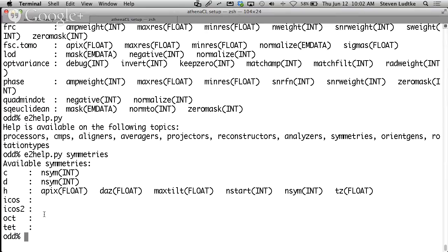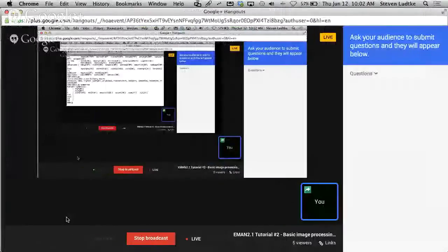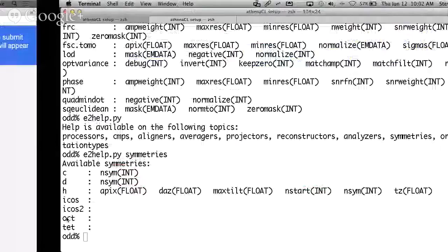You'll notice there are, of course, other symmetry groups that exist, but all biological objects have handedness. So any of these symmetry groups that have a mirror symmetry present in them, have a mirror operation present in them, aren't valid for a biological context. So this should represent all of the available symmetries that you might run into.